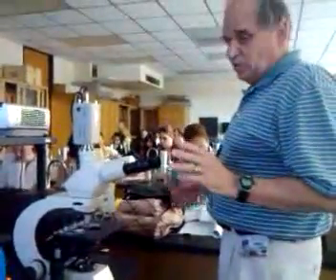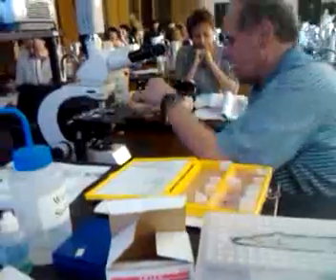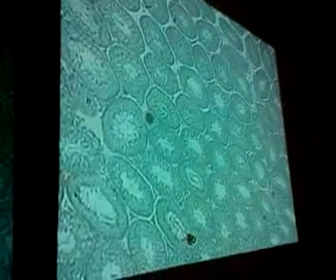One other thing that works pretty good, it's pretty easy to see, is in the rat testes, the seminiferous tubule, and where spermatogenesis occurs. Now let me tell you this. Let me show you this one. This is going to show spermatogenesis. Let me show you something. Okay, that's good. That's going to be good.